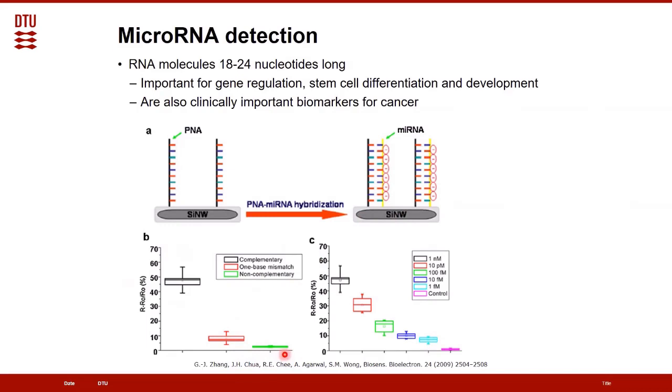But the interesting part is that it's so sensitive that even a one base pair mismatch will greatly reduce the signal from the fully complementary to just one single base mismatch. And of course, the signal is also concentration dependent and actually has a very good sensitivity.